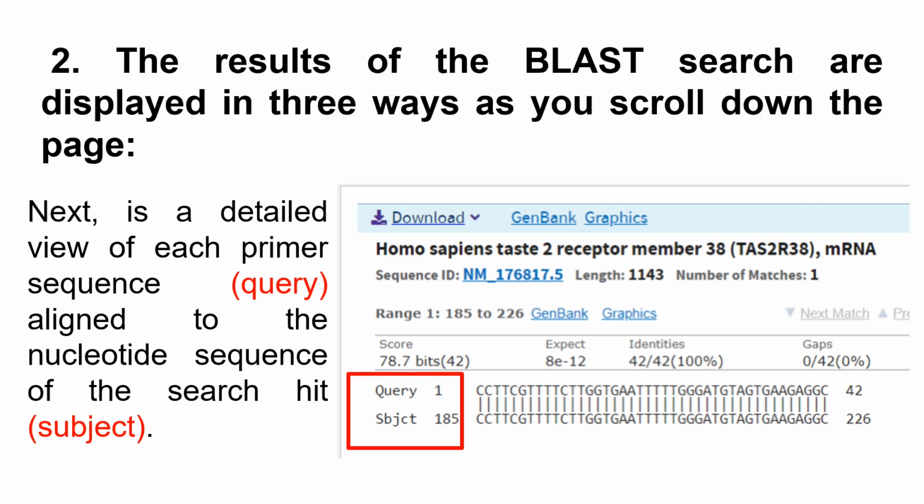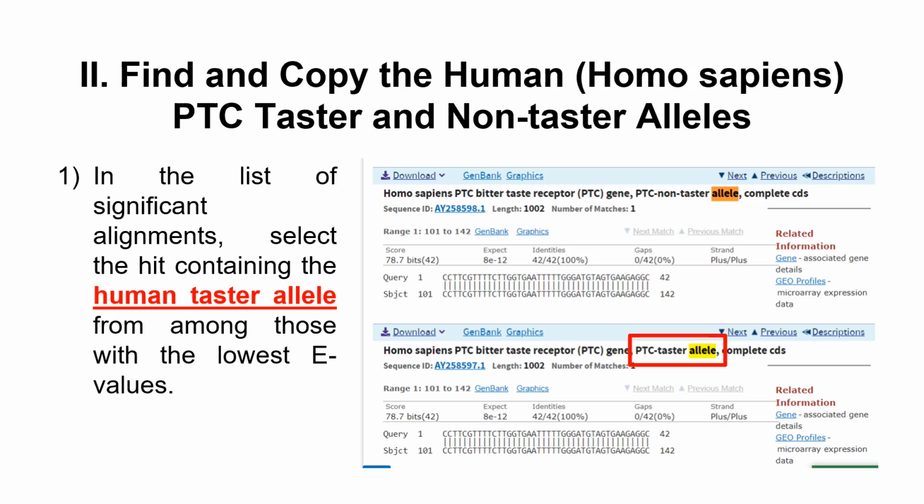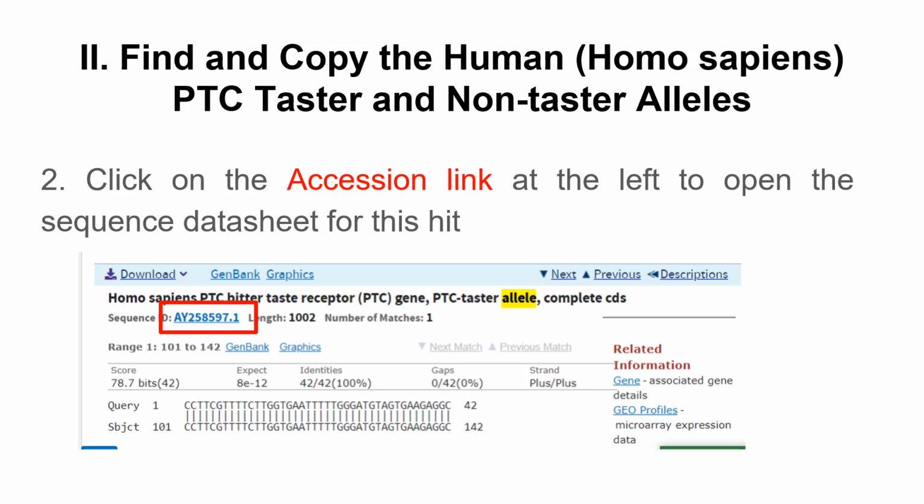For example, here you can see the small section of DNA that I sent you, and how similar it is to the other one. Again, here you also get an e-value that is very important. Here are the names of the genes that you picked. Here you have the accession link, so you can see it in red. And just so you know, similar to the previous assignment, in a test I may ask you what the expected value is, what the score is, or all this information. So make sure that you know how to do it.